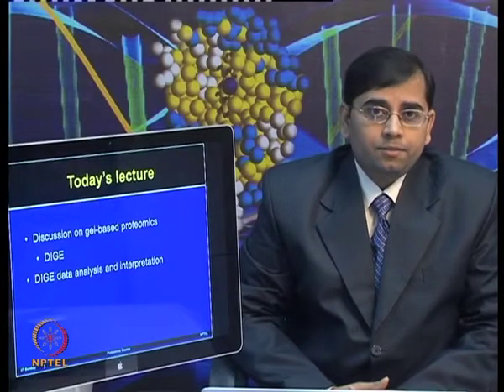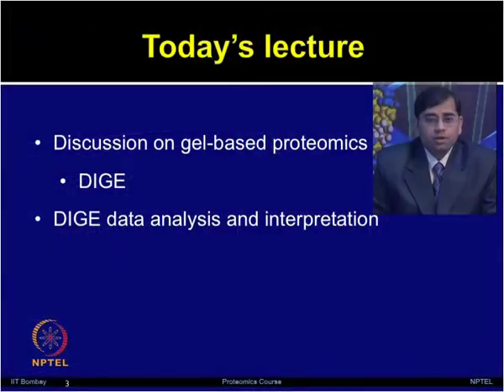In today's lecture, we will continue our discussion on gel-based proteomics, certain advantages and challenges of performing DIGE experiments, how to analyze DIGE data by using a few very specialized software, and how to interpret that data and obtain some meaningful biological information from those analyses.